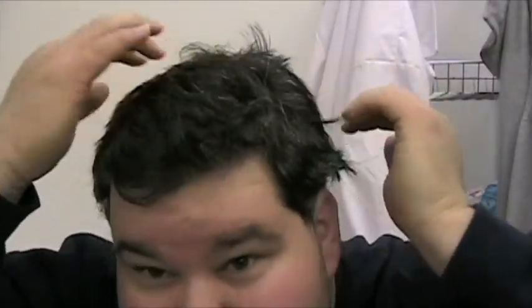I've got my lab hair on — looks good. Good morning, chemist in Japan. Basically what I'm going to show you is a couple of things that I do that are very routine.